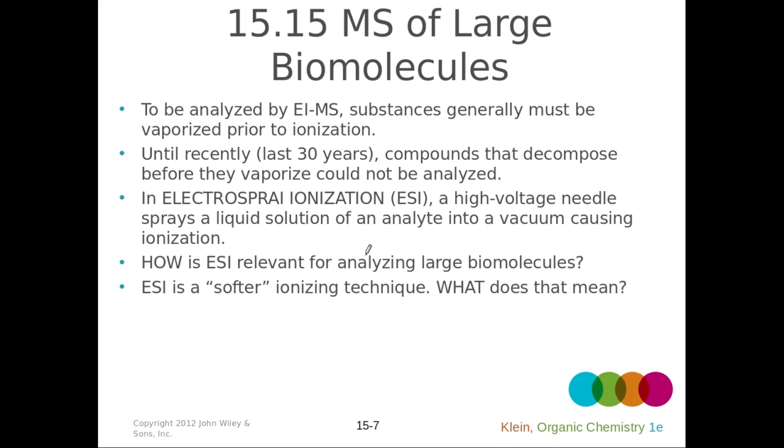There's a typo here, where the high voltage needle sprays the liquid into the vacuum chamber, and that is going to cause this to be ionized, and then it will be carried with carrier gas toward the detector, and hopefully we will be able to have a molecular ion peak for our large biomolecule. So these softer ionization techniques allow for the analysis of larger molecules.